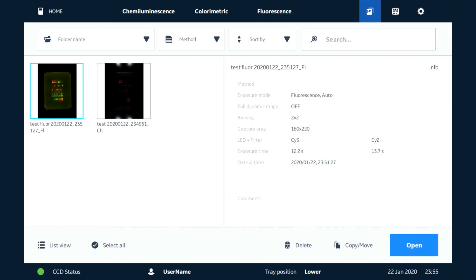We also have the option down here. You can see that we can copy and move images to different folders on the system or onto the network. We also have the option to delete an image if we decide we don't want to keep that anymore.